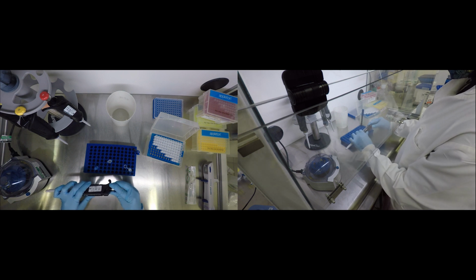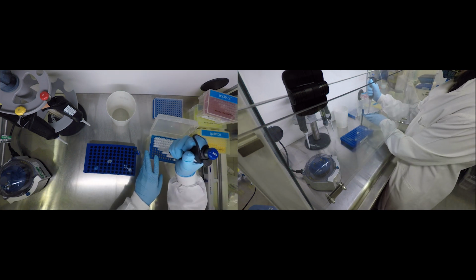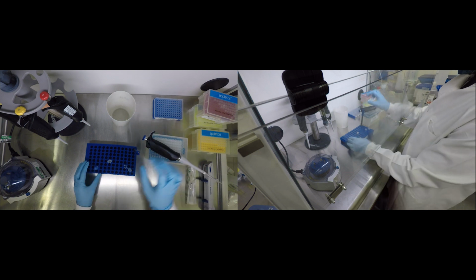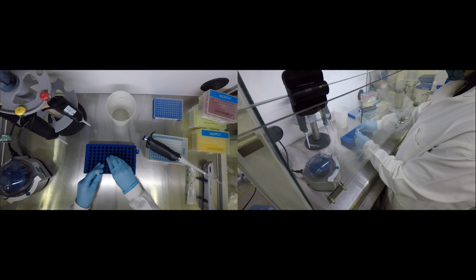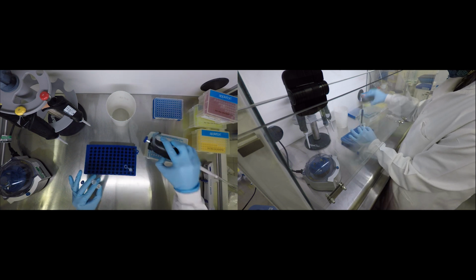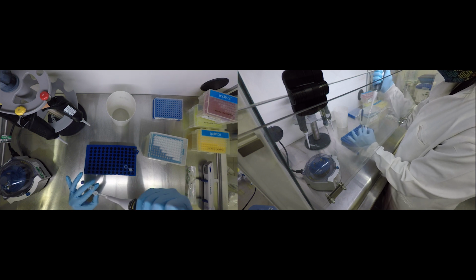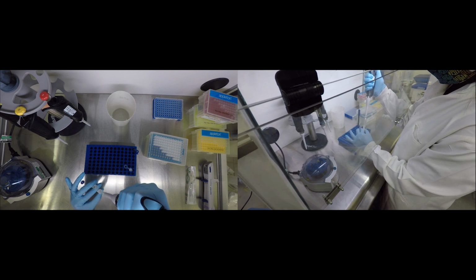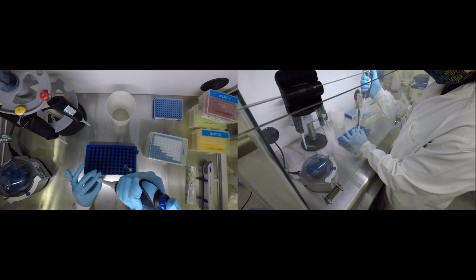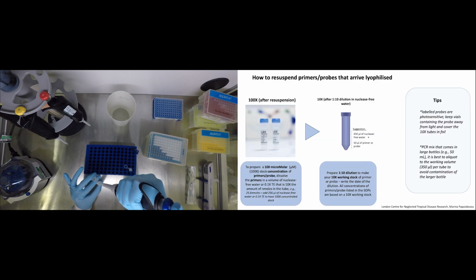Once you add that volume of 0.1 XTE, resuspend by pipetting up and down. Once you're done, you can flick the tube and spin it down. Then make a working stock of that primer or probe by creating a 10-fold dilution into a new clear tube. For example, you can add 50 microliters of 100 micromolar primer or probe stock in 450 microliters of nuclease-free water for a final concentration of 10 micromolar. This will be your working stock.